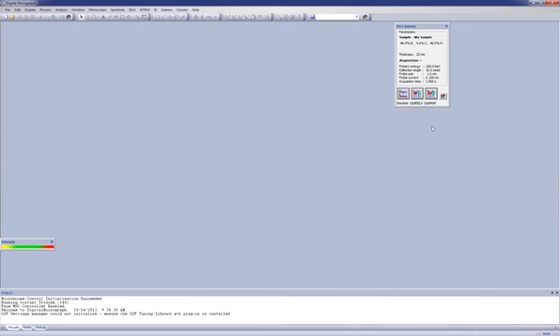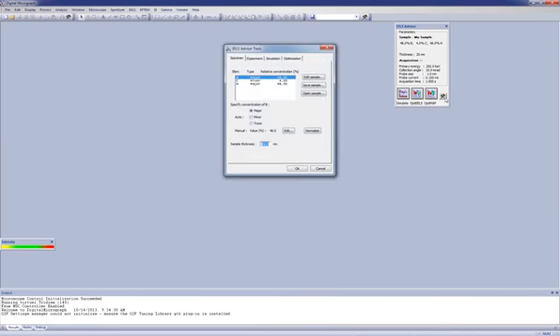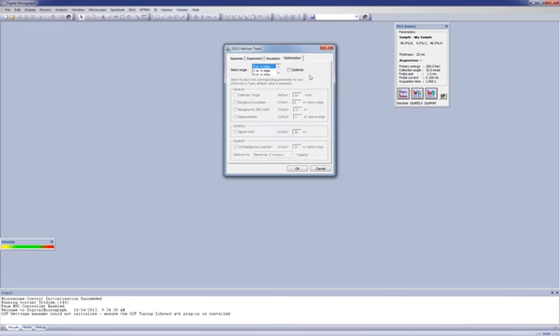So if we revert back to Digital Micrograph, we can see the presence of this OptiEELS button in the EELS Advisor palette. And to configure that, we hit the Tools button once again and go to this Optimization tab. So let's say we want to look at the optimization at the carbon K edge. In that case, we simply go to the Optimization tab, we select the carbon K edge, and we check the Optimize checkbox.